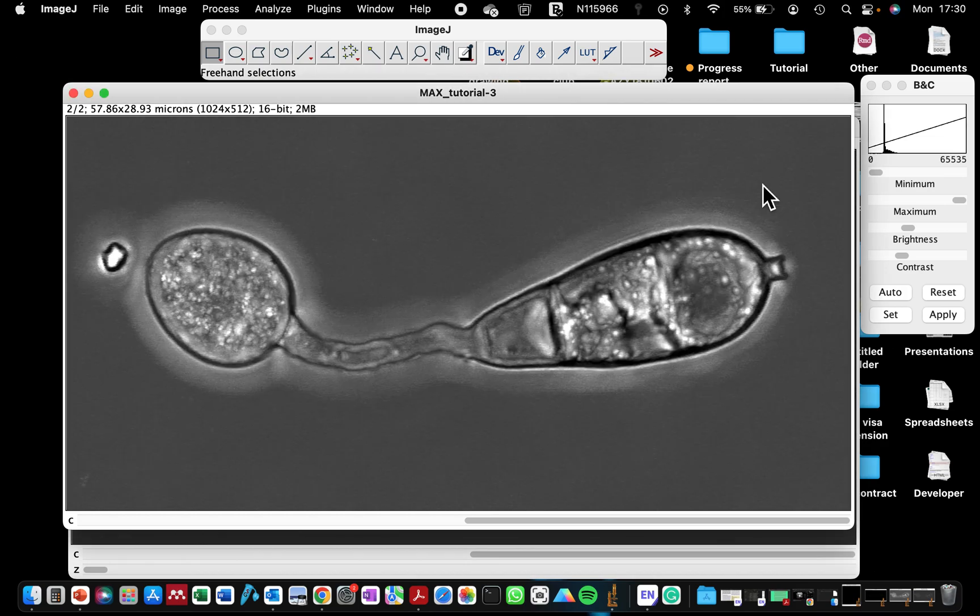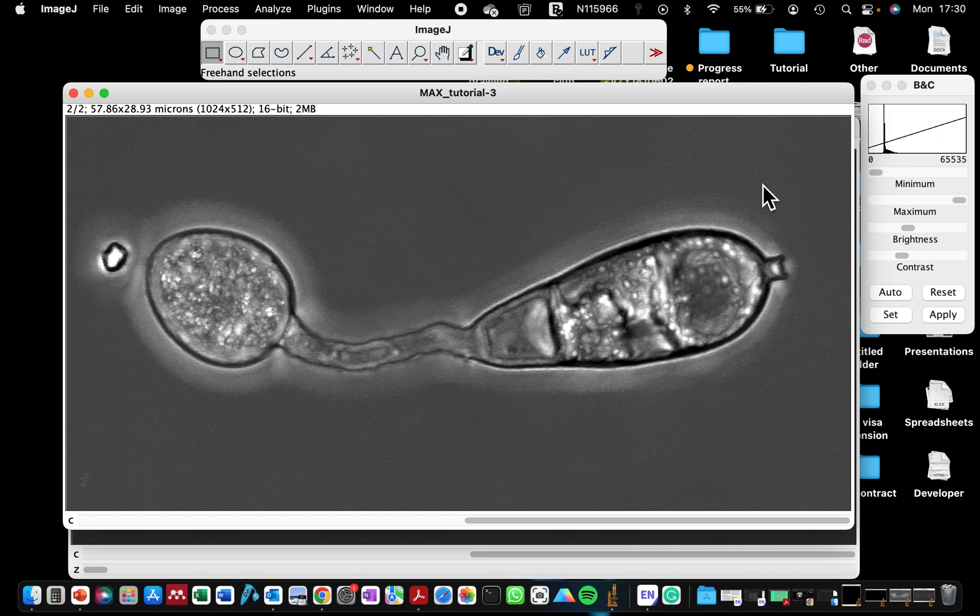Write that down in your lab book so that when you're trying to reproduce that image, you remember that you've applied a 0.3% pixel to all the images.